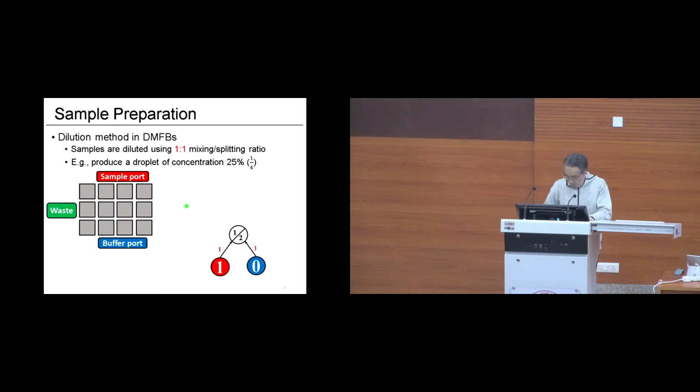Samples, for example. So where is it? This. Okay, so here we have some sample, the red sample, and this is a ratio. The sample's ratio is 1, so 100%. And the buffer is a kind of special water, to mix with samples. So the ratio is 0.